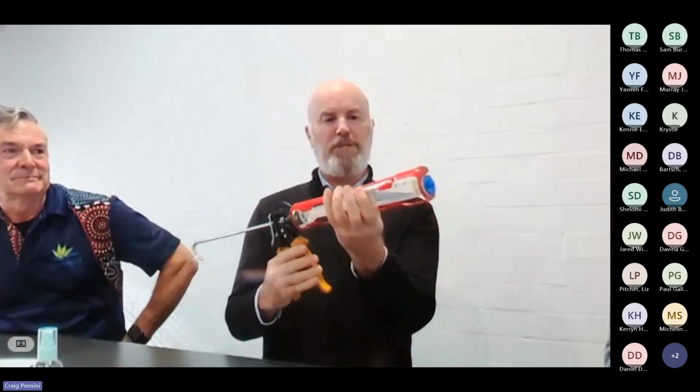Yeah, and that's exactly one of the questions that we had, that somebody's done some recent sampling and it was too difficult to get through the sieve. So I think you might have a couple of options there. What we switch to, because otherwise you get sore hands, is your old corking gun. Nice and simple. If you've sucked up your water, you can just pop it in there, and then you're just pushing that through, and that makes life a lot easier.